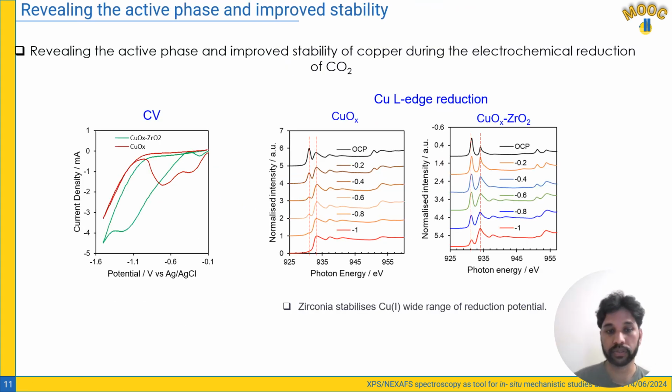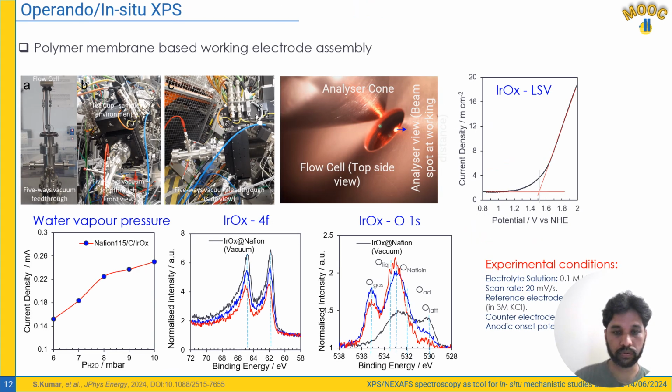We also have a light source on the end station, so you can also do photoelectrochemistry, probing in situ while doing the photochemical reaction. That's one of the applications.